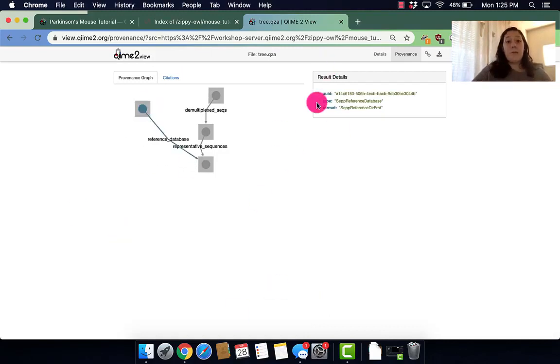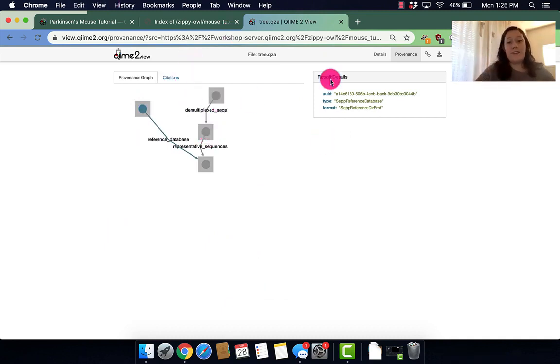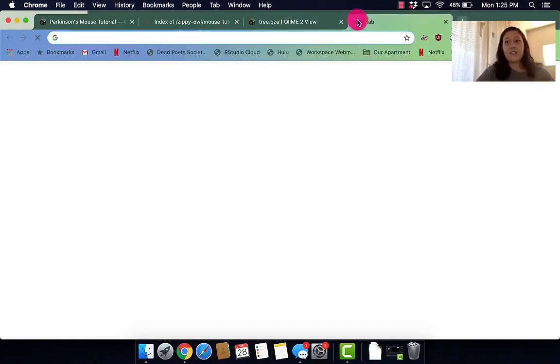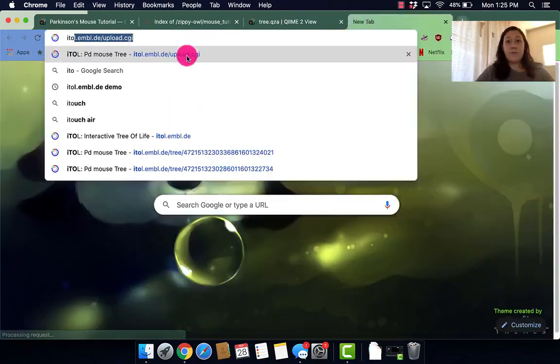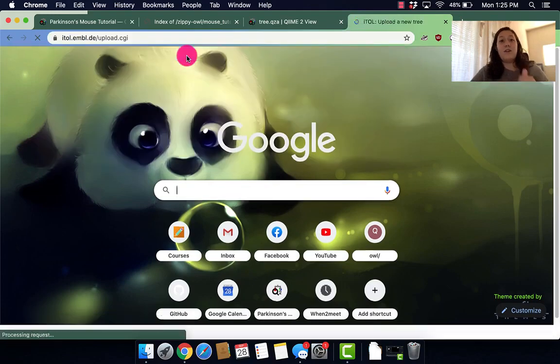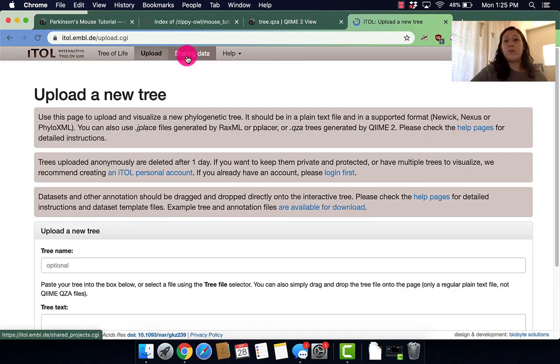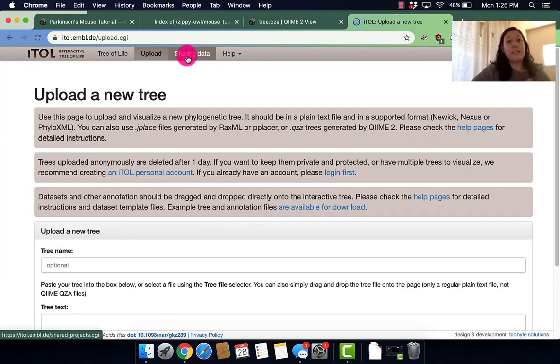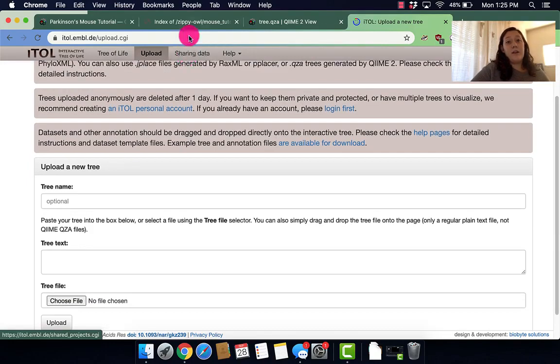So as you can see, our little provenance graph is definitely growing. And it's kind of exciting to see it take shape. So besides looking at the QZA format, we can also look at more of the phylogenetic tree by going to the interactive tree of life website.